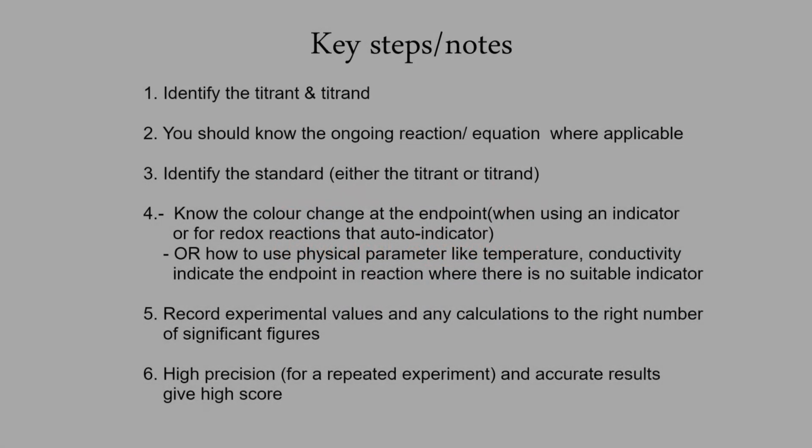We have already gone through the basics of quantitative analysis. Please note, whatever the process, all involve the slow addition of one reactant to another until one is depleted. After scanning through the procedure and locating the reagents, run through this checklist before starting the experiment.